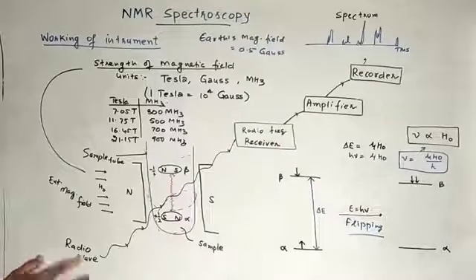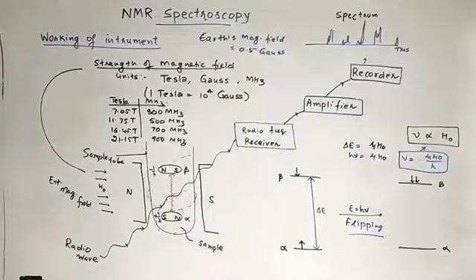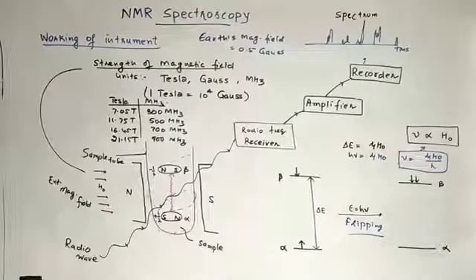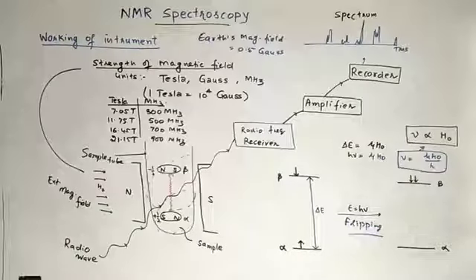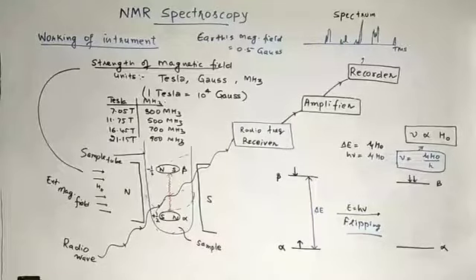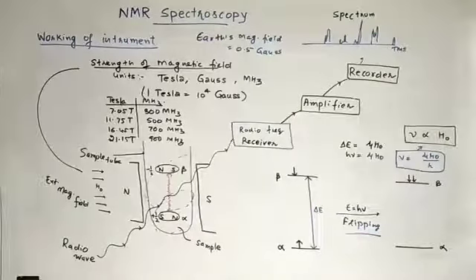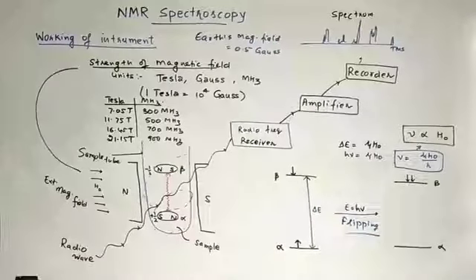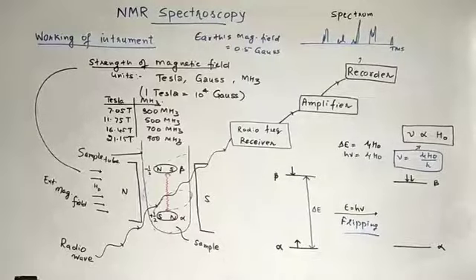After that, by tuning the NMR, the technician will get your NMR spectra, and that spectra gives information about the structure of the compound. You already have the structure of the organic compound, so you can compare which peak is due to which type of protons. In the next lecture, we will discuss various types of protons, equivalent and non-equivalent, how peaks appear, how peaks are split, and see how the spectra is formed when a compound is given for NMR analysis. Okay, thank you.